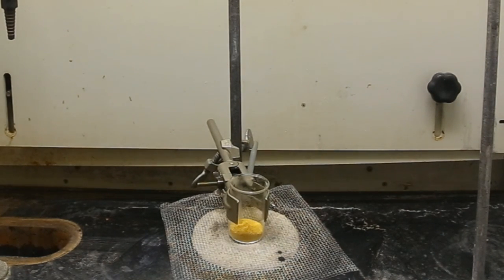The final yield of P-Nitroaniline was an abysmal 15 grams out of a theoretical about 40. This gives a yield of about 38%, which is quite low. The main loss of product is probably due to the fact that there is a decent amount of ortho product that is produced in this reaction. And unfortunately, the production of the ortho product is not easily avoidable.